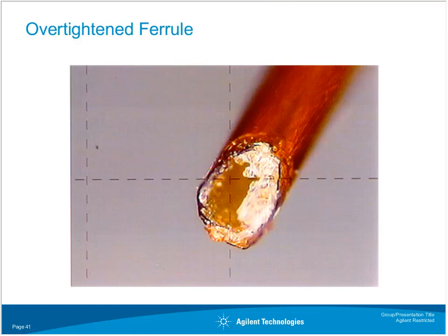If you over-tighten it, and this is going to be a little bit easier to do with the graphite Vespel ferrules, you can crush the column, you can have inlet leaks, you cannot see your peaks because you can essentially collapse the whole column or get the ferrule in there. So these are just some of the issues that you can run into from a column installation.